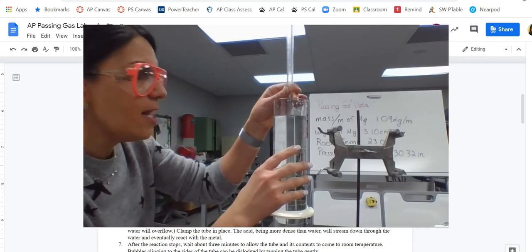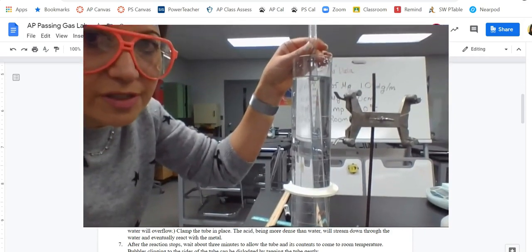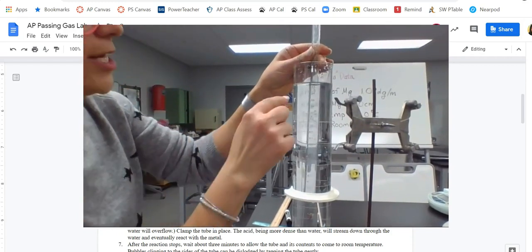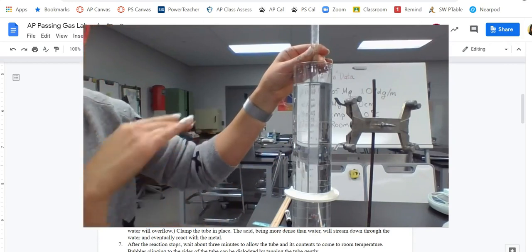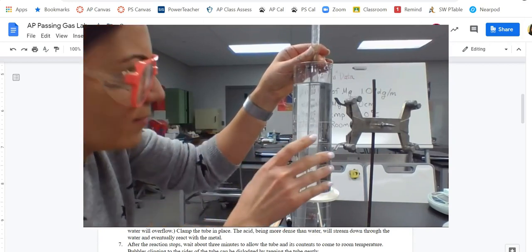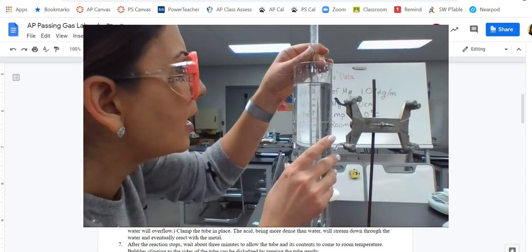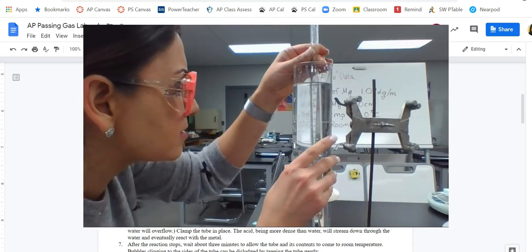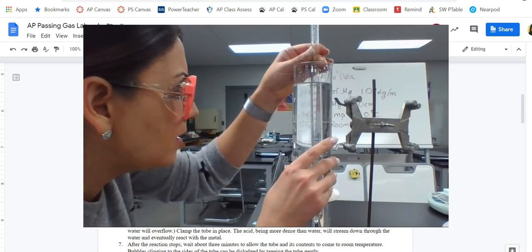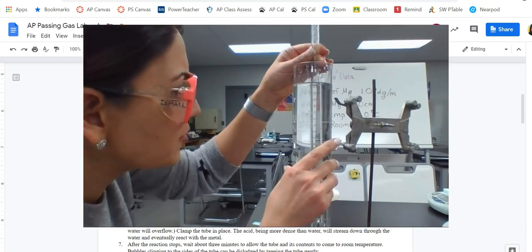This isn't very easy, but I kind of want you to get a little bit closer here so that you can see this. So I know that it's going like 32, 33, 34, 35, and before I was pretty much right at the 33 mark, but right now it looks more like 32 point, I'm going to say 32.60. Saying it's about, yep, 32.60.